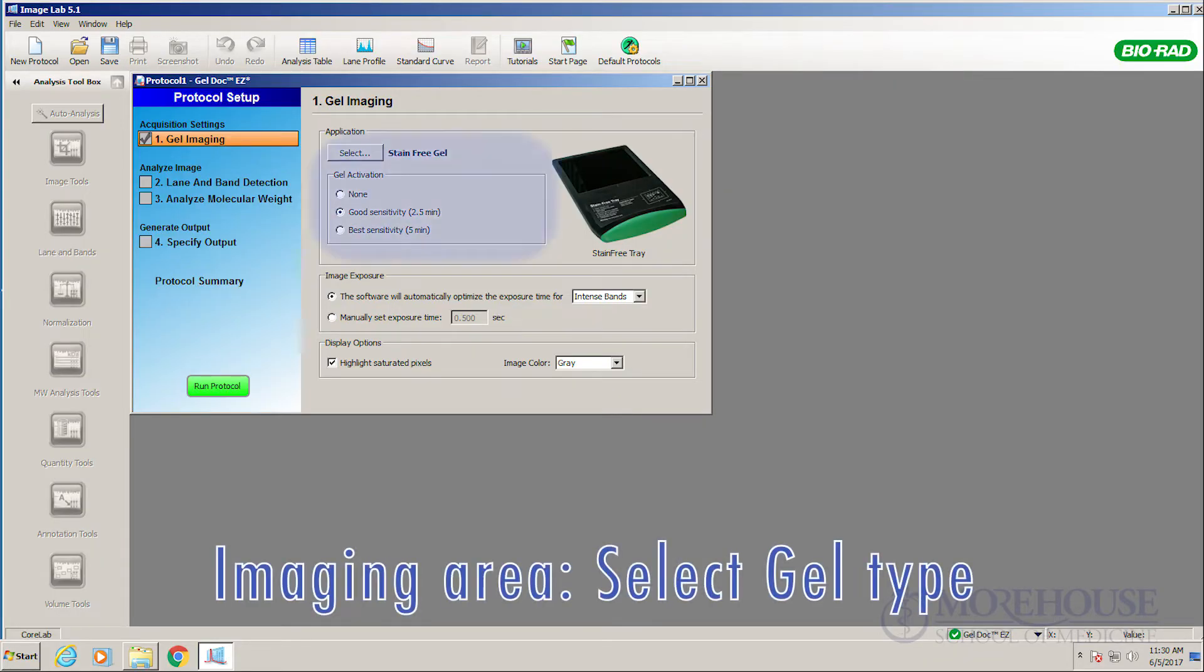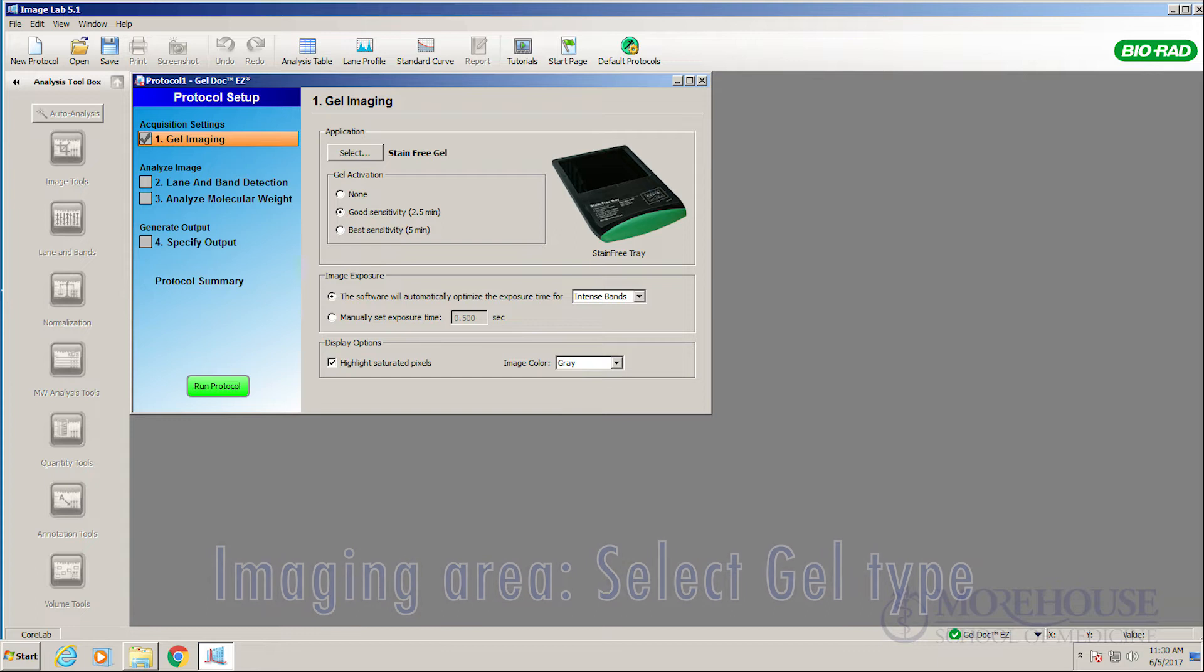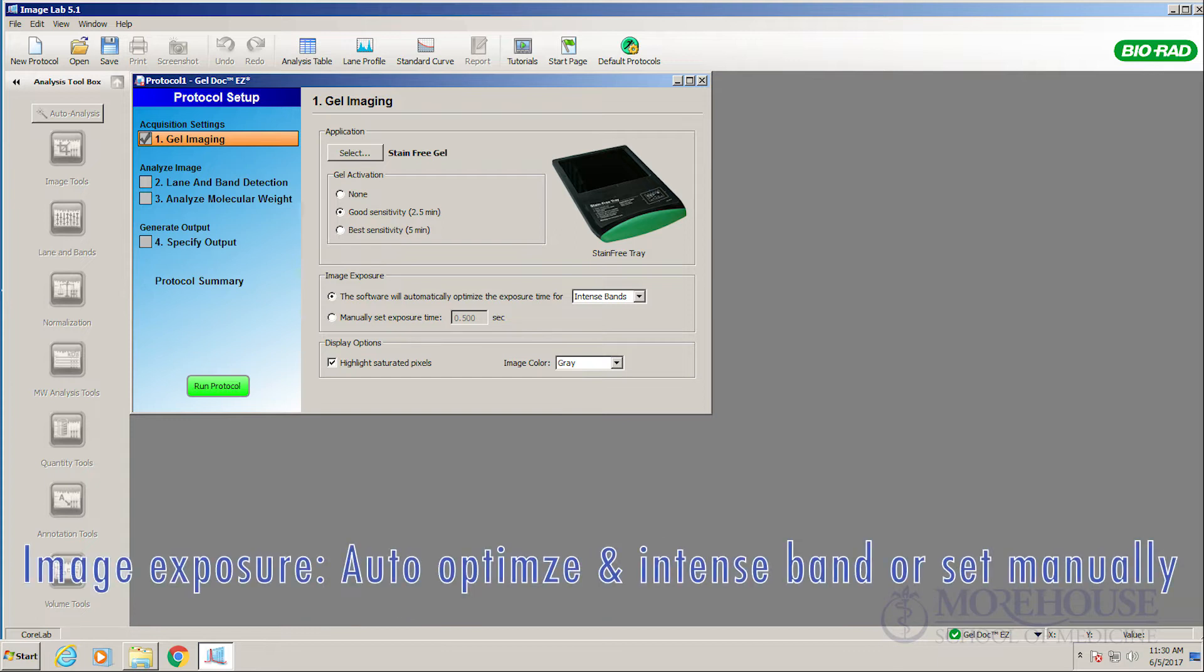Imaging area. Select gel type. Image exposure. Select auto-optimize and intense band or manually set exposure.